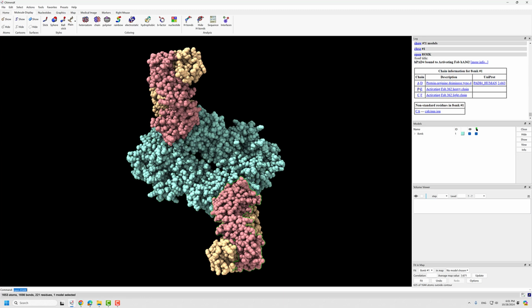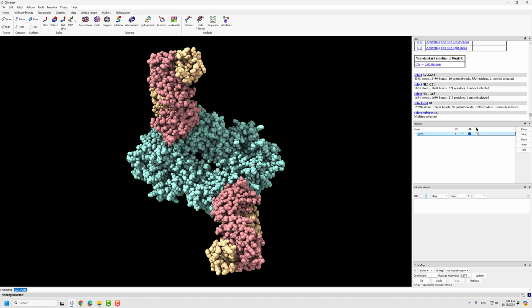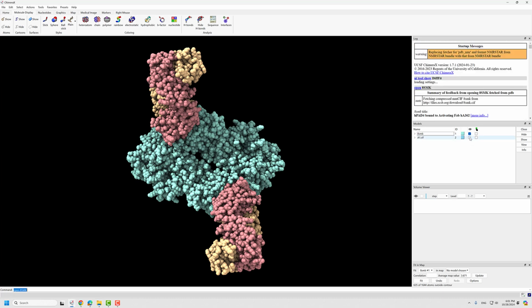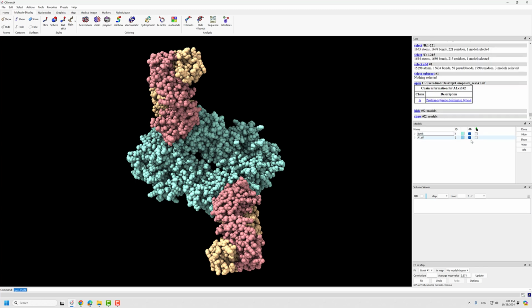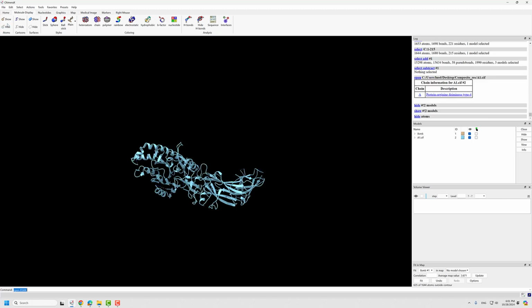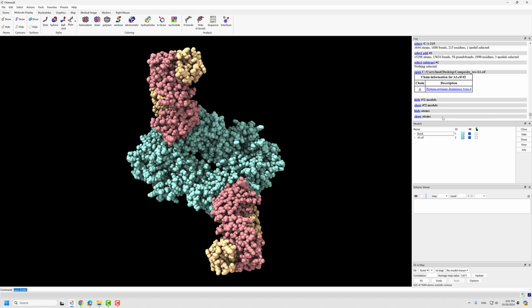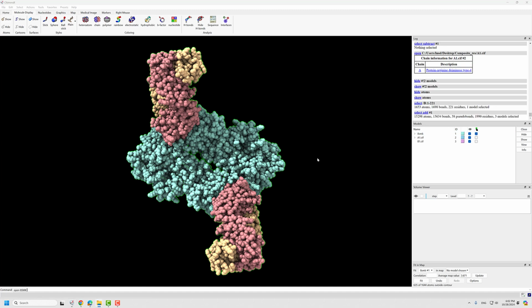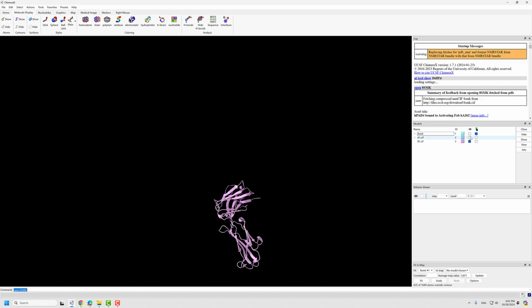A, B, C, okay. I think that's A1. It's supposed to be this A. Yes. The B is here. I think that's B1. Yes.